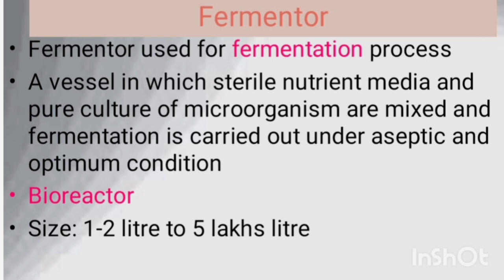Fermenter is also called bioreactor. It is a system that provides an optimum environment, or the proper environment, for the growth and metabolic activity of the microorganism, so that we can achieve the maximum production of industrial product. Otherwise, we can define the fermenter as a vessel in which sterile nutrient media and pure culture of the microorganism are mixed and fermentation process is carried out under aseptic and optimum condition.